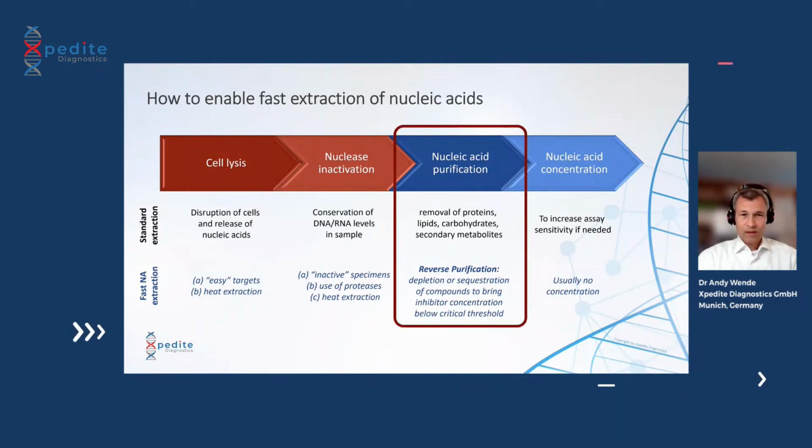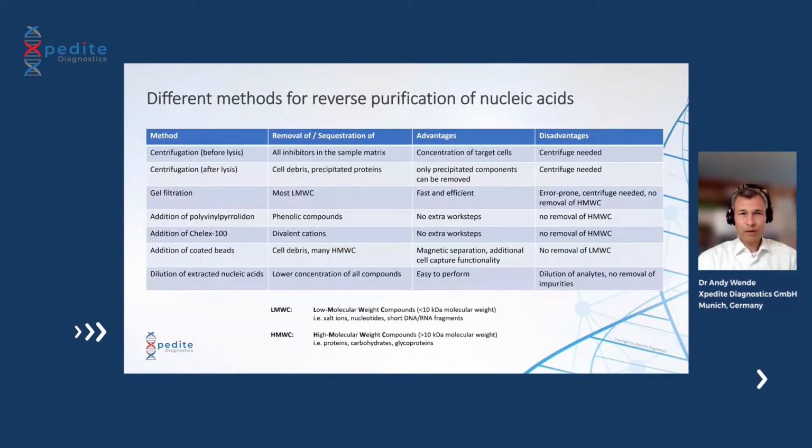So let's look into this reverse purification part a little more. The left half of this table you already know from my first slide deck from the first session. And I would like to go through all of them again and especially also talk about the advantages and disadvantages. So let me use a laser pointer.